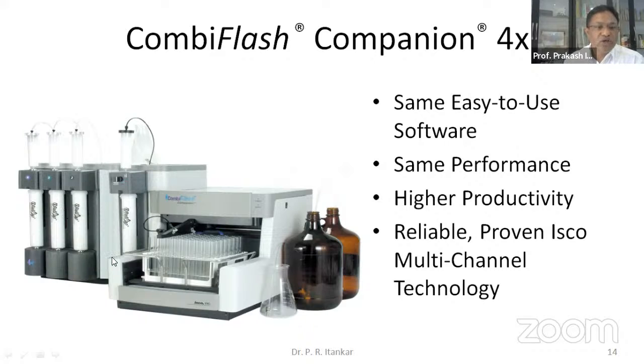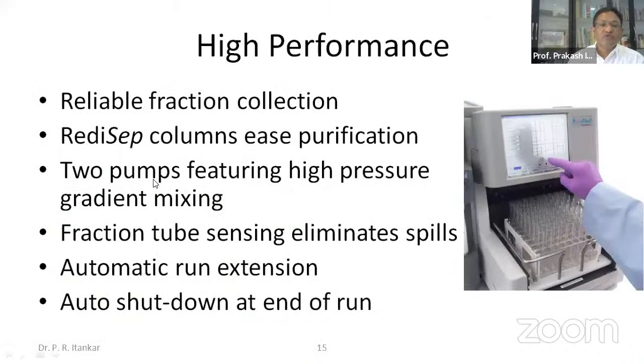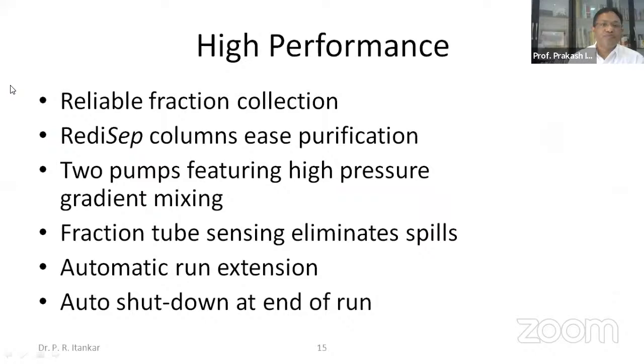You can multiply your yield by adding different channels. This arrangement helps us in quicker isolation, isolation in quantity, and those isolated constituents remain the basis for our further drug discovery.